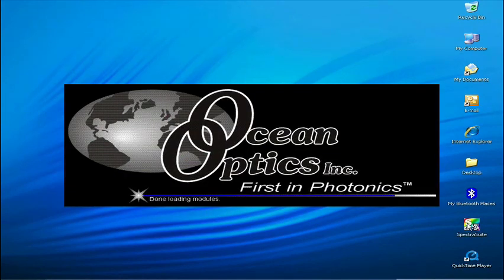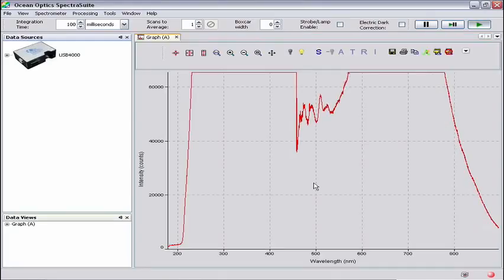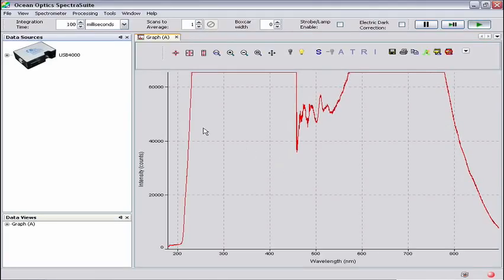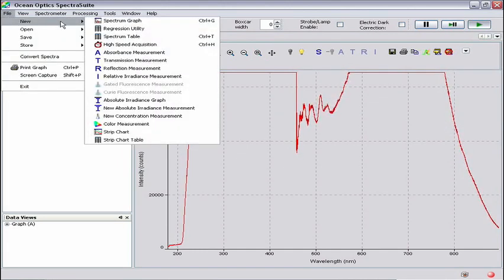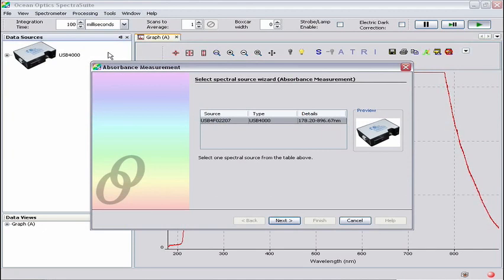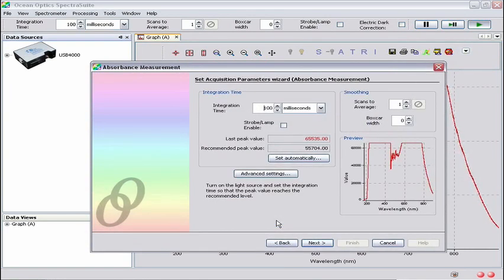There are two ways to use a processing mode. The first method uses the absorbance wizard. To start the absorbance wizard, click on File, then New, then Absorbance Measurement — this is the menu item with the blue A next to it. Select Source; in this case, the USB 4000 UV-Vis spectrometer, then click Next. We're now at the Set Acquisition Parameters Wizard window. This function allows you to optimize spectrometer settings for best results.